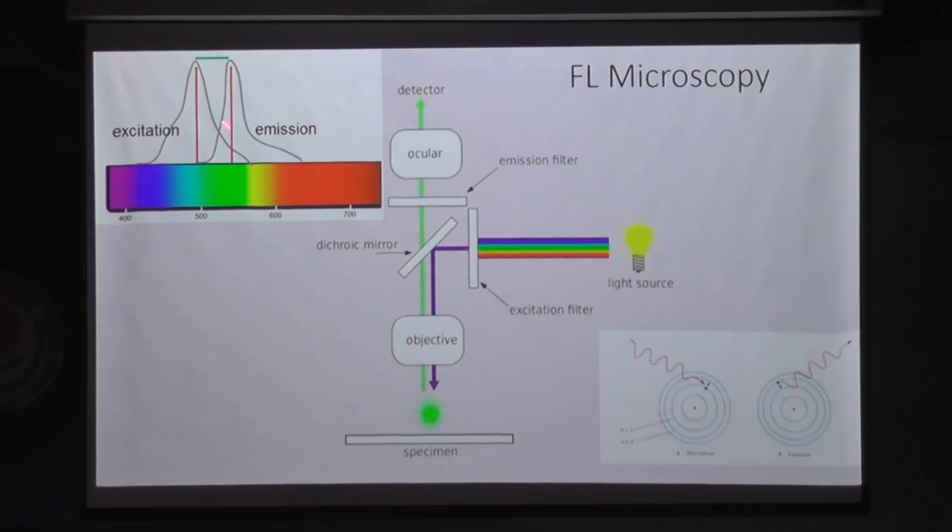It gets excited at 400, and, just assume, it gives emission at 500. Though the number is more, the energy within that light is lesser. So we can say red light always has less energy than violet light, but the wavelength of red light is always greater than that of blue or violet light.